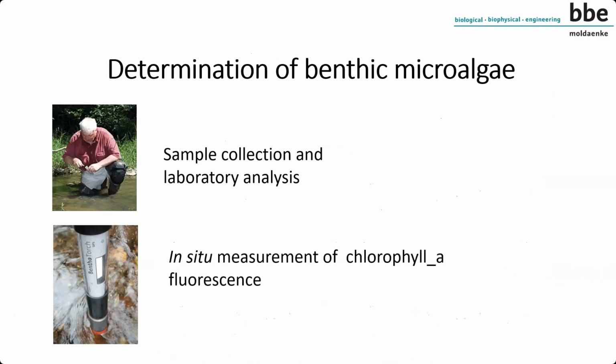We have here someone who collects the samples. This is a phycologist. The name is Frank Acker. He sampled the algae from the surface and brought them to the laboratory. So what he's done, he scraped these biofilms from the surface and put it in a bag.